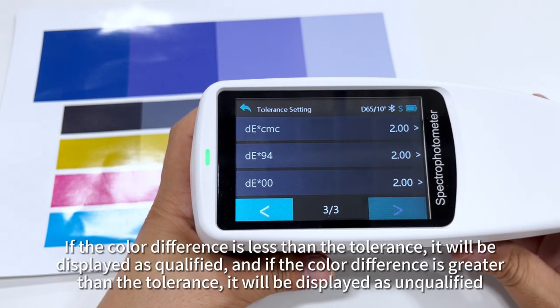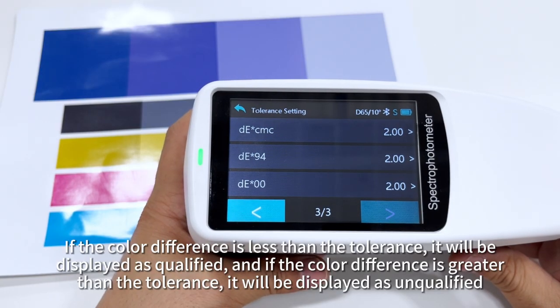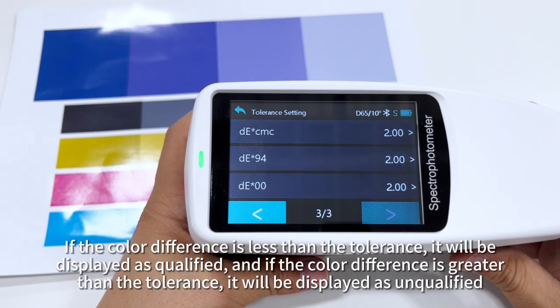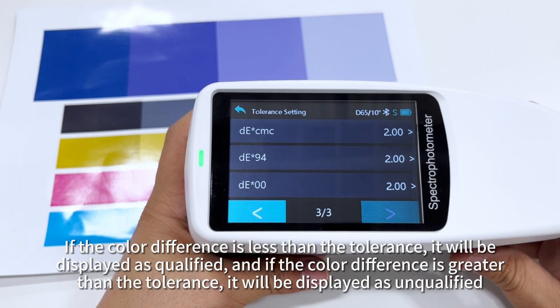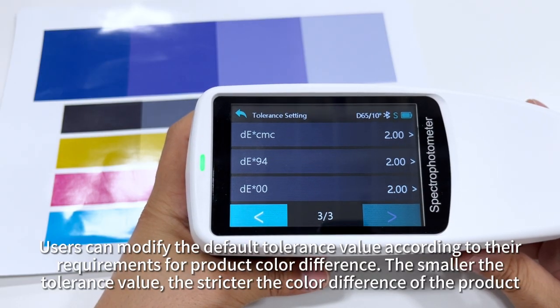If the color difference is less than the tolerance, it will be displayed as qualified, and if the color difference is greater than the tolerance, it will be displayed as unqualified. Users can modify the default tolerance value according to their requirements for product color difference. The smaller the tolerance value, the stricter the color difference of the product.